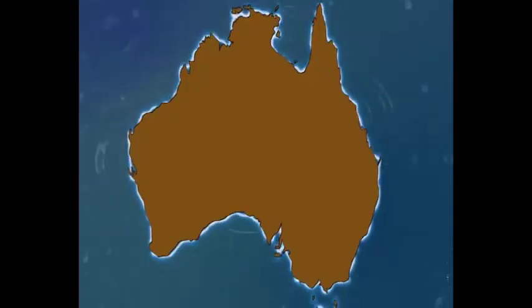Here's a clip which goes into detail about the process of sampling, and it's talking about sampling for lead content in fish. It will go through the entire process of how they would go about using this AAS in a real world scenario. It goes into quite a bit of detail, but you should be able to understand most of it, and it will help you to put this process into context as to how it's used.